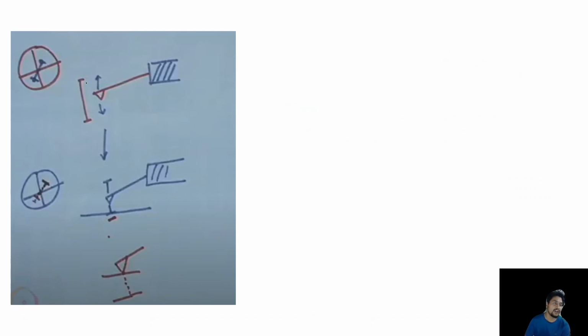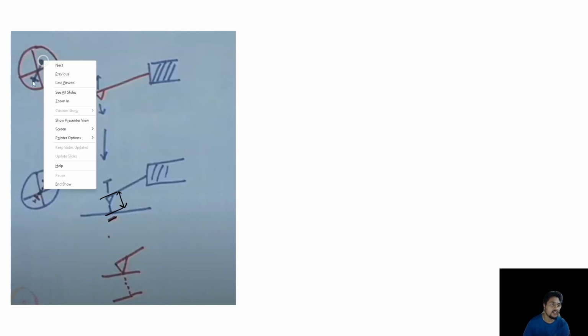Let's say this is the free fall up to this. This is the deflection range. But whenever it is near the surface, at that time it cannot go. It should go up to this, but it is only going up to this, right? I think you understood. So let's say in case of free vibration, we are getting this position. Like in case of contact mode, we are only getting the zero point.